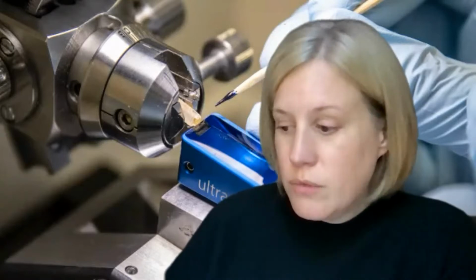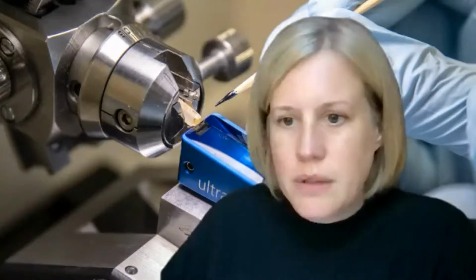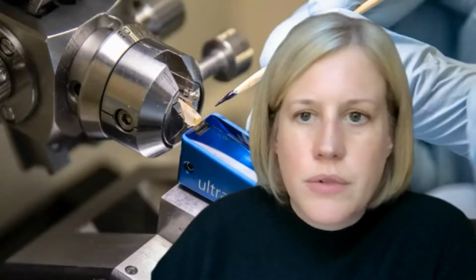Yeah, I completely agree with you, Alex. And we do, stereology is really important, and we do still use stereology for some of our work. So what I haven't really talked about today are the projects, and there are plenty of them where we really just still use transmission EM, usually correlative, but still just 2D transmission EM, and we can still get a lot of information. Even in 3D, I think Yannick Schwab's work showing kind of stereology in 3D as well by imaging parts of cells with focused ion beam SEM is really important.